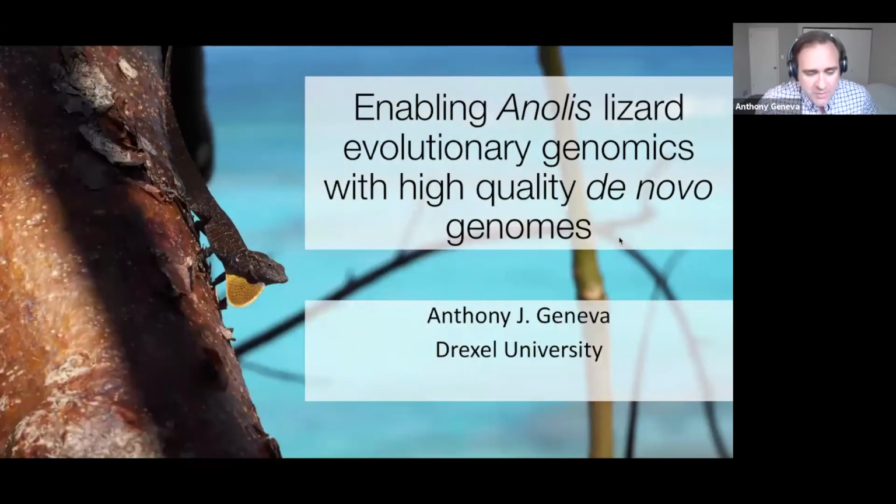So. Hi, folks. Thanks for coming. I'm going to talk about 9 genomes that we've been working on now for 3 years with Dovetail. The majority of the talk is going to be about the one that we selected as our flagship to take all the way through the process. But I do have some things to say about the other 8 and some comparisons we can make, given that we have a set of 9 closely related genomes, just to give you some insight about how the assembly process goes and what are the things that influence continuity and completeness of genomes.